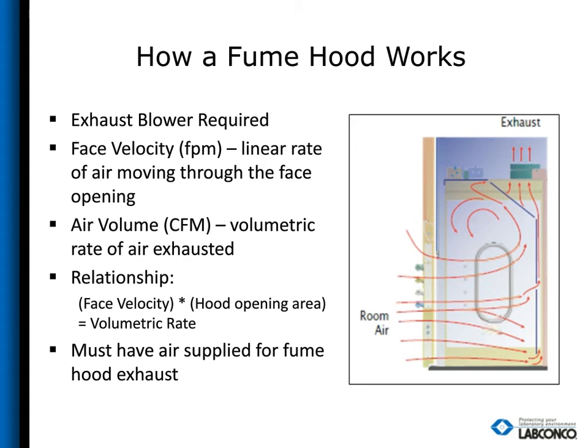Same thing with a fume hood. The more air you put through the fume hood, the faster the face velocity, and also when you shut the sash, the same amount of air will move faster. We can measure face velocity, or the speed of that air, taking a thermal anemometer, or you might hear a hot wire anemometer, and placing the probe end in the plane of the sash. The sash is the glass window that moves up and down on a fume hood.